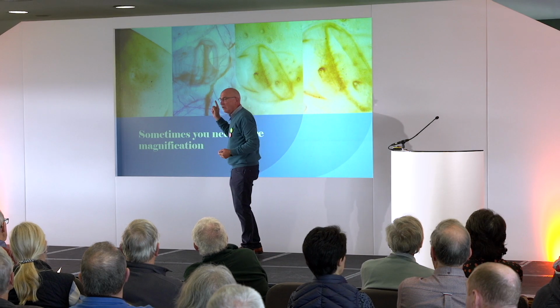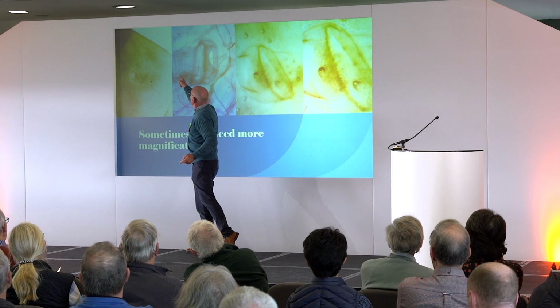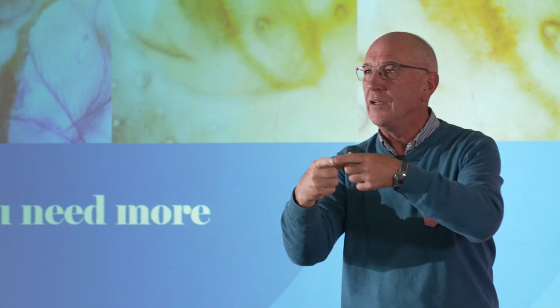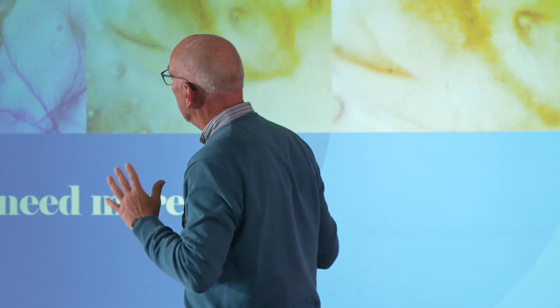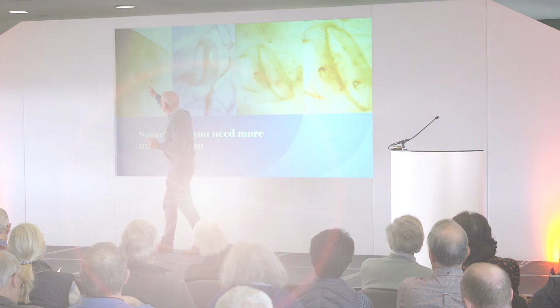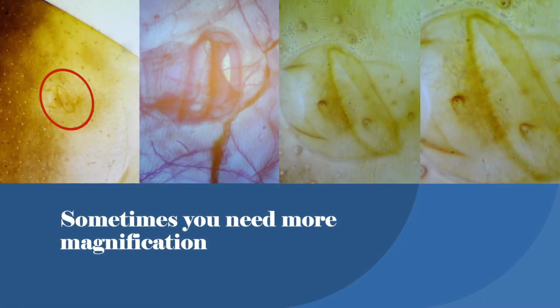And also, I don't know if people are interested, you can just see lines going across. On hose pipes, when you buy a hose pipe, it's got these lines to keep it rigid. So the trachea have things called taenidia, and the taenidia are rings of cuticle which hold the strength, so the trachea doesn't collapse inside the body. But anyway, sometimes you want to look closer in, because that is probably 20 or 40 times. You want to come up and look.